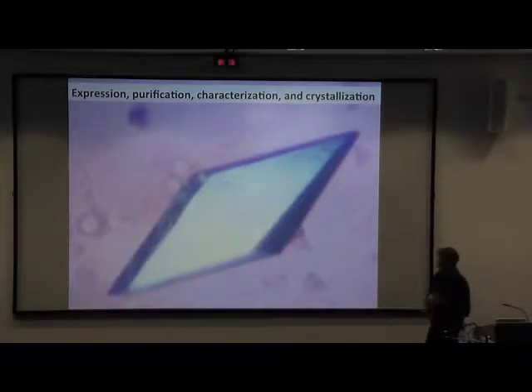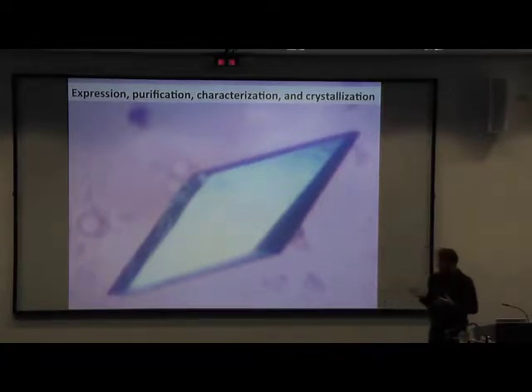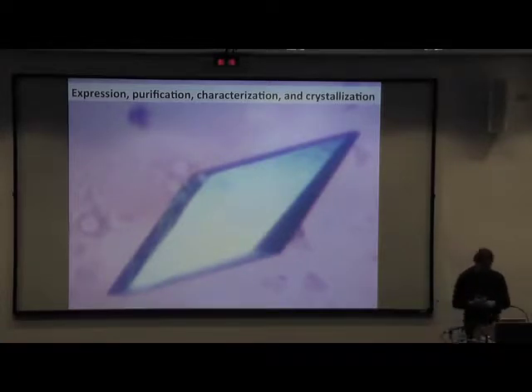So today I'll be trying to tell you a little bit about the things that I try to do to actually get a crystal that not only looks pretty, but actually will give you the diffraction data.